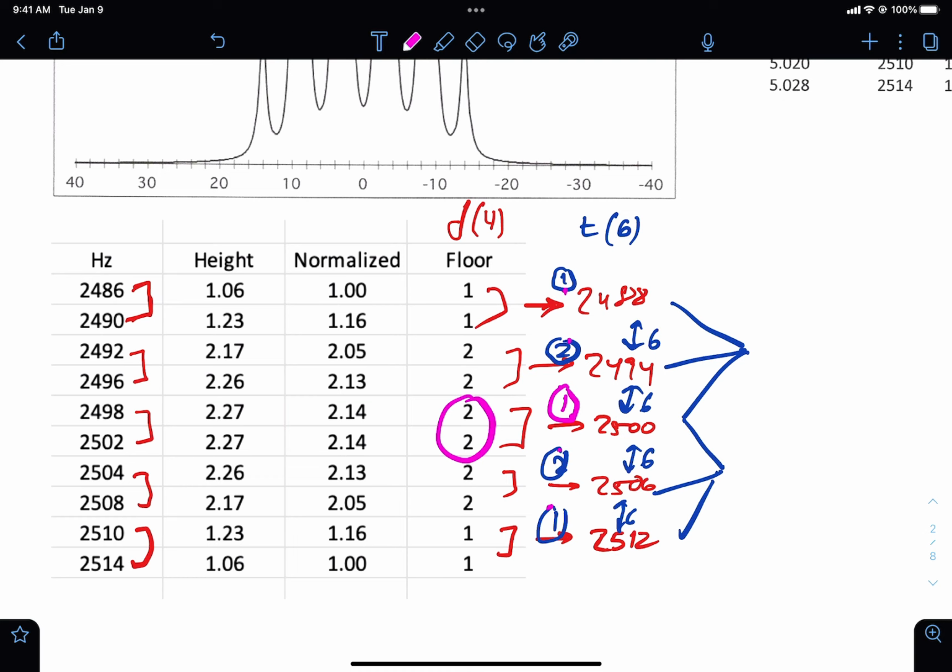So we can see the 2 triplets here. You have to look carefully, and you have to be very familiar with what you're doing. But we have to look for a triplet, right? Our first pair was 1 to 2, which only shows up in a triplet. So the only way we can get triplets out of this is if that middle number is shared between 2 of them, thus making it 2 overlapping 1s.